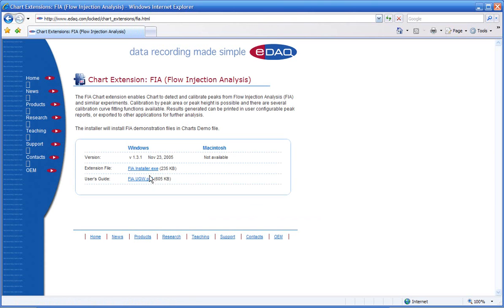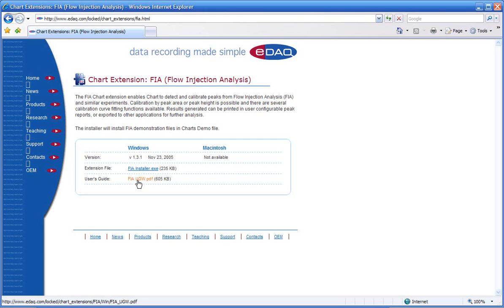You can download the FIA flow analysis extension from here. Here's the user guide, which you should download as well.